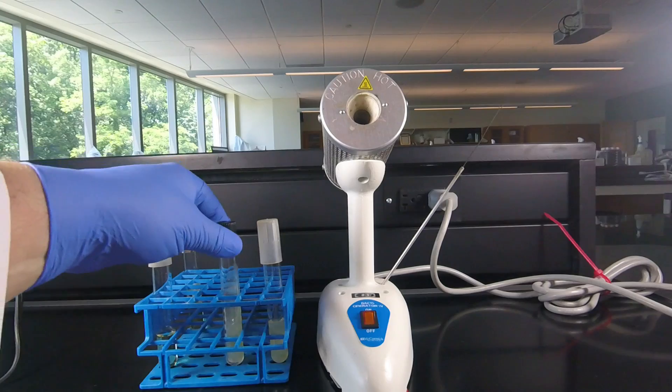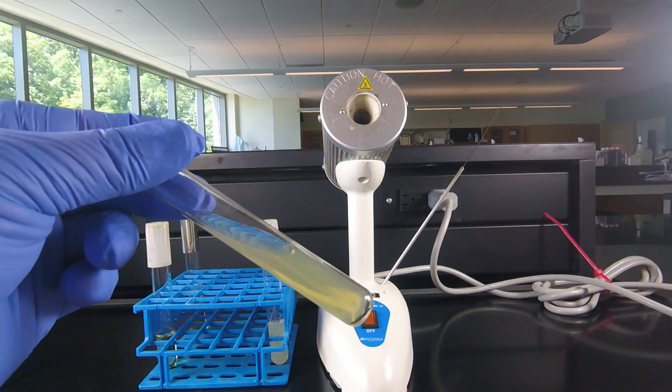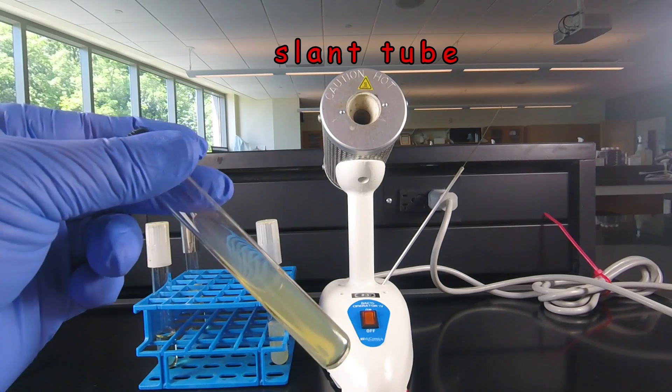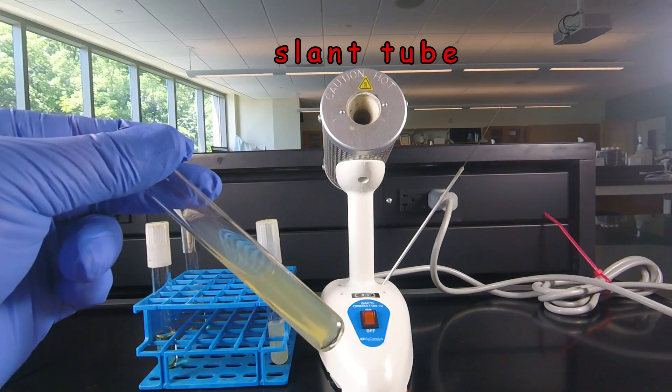We can also let the agar solidify in a tube at an angle, like we see here. And that gives us a nice flat surface on which to grow microorganisms. We call this a slant tube and we call those slant cultures.